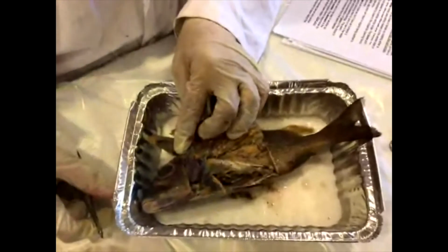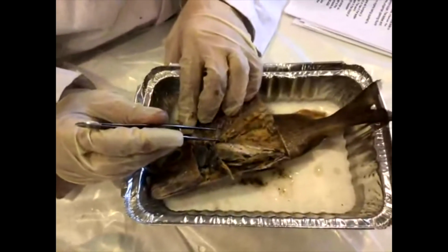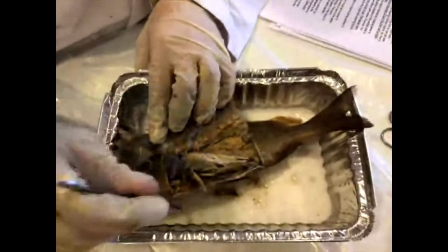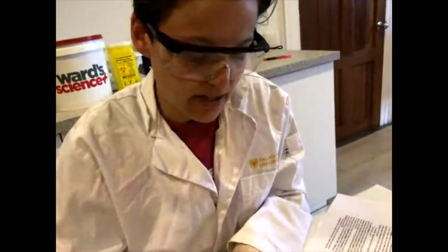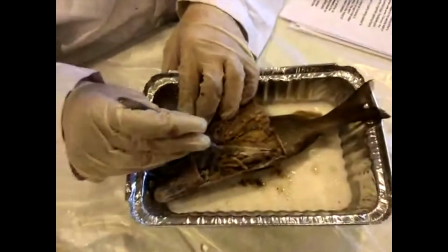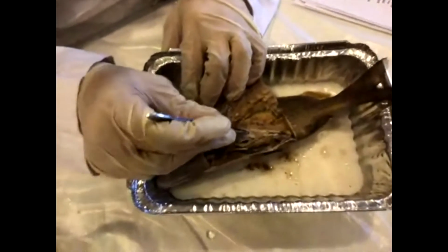So Evan asks, what do we even draw? All the things that Hill is telling you to draw at this point, otherwise it's going to get too cluttered. It doesn't have to be perfect, just draw the general area of where everything is. Exactly, yeah. You could even draw an exact square on your fish, exactly where I cut, and then honestly, everything is going to look a bit like a blob. So you can draw a big long blob along the middle for your swim bladder, and then a smaller blob for your liver. And if you have colors, maybe you can even use colors to distinguish. This liver is a little bit dark colored or yellow, and then the swim bladder is almost entirely white.